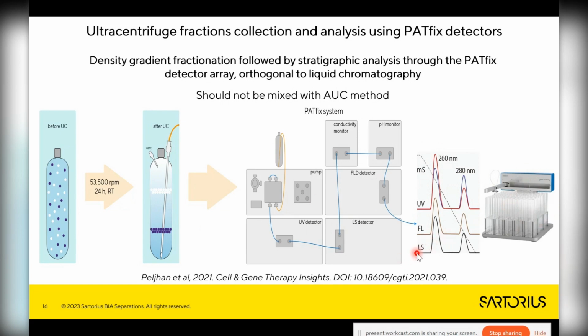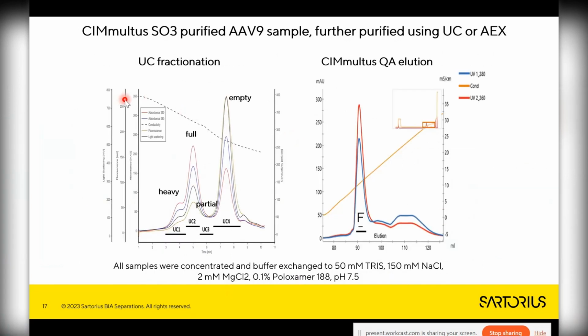So the material coming from the ultracentrifuge would start here. That's the material which is here. Then we push the material further. The next one to come out is the full band, which we can trace with the fluorescent detector, the multi-angle light scattering detector and the UV detector, and then further down. If we do a good job, the conductivity curve of cesium chloride should show us quite a nice linear gradient. And this is exactly what we performed on a real sample.